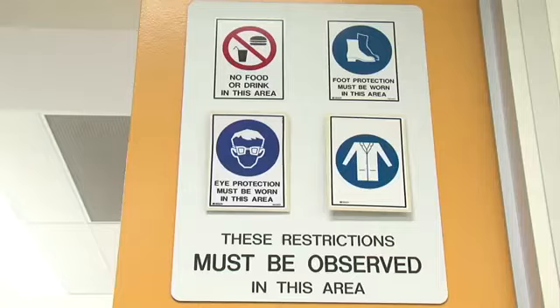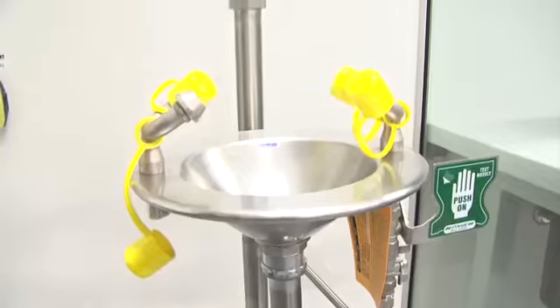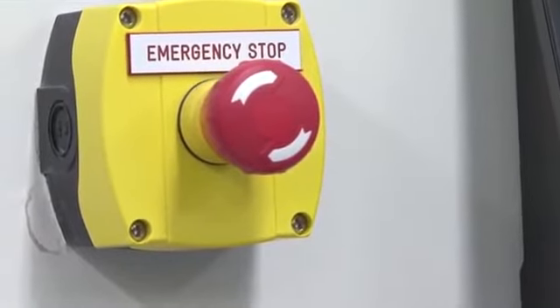The safety of both students and staff is ensured in these digital teaching labs. The labs have been fitted with a complete range of safety systems, including eye wash and safety shower, flashing evacuation alarms, and an emergency electrical and gas cut-off system.